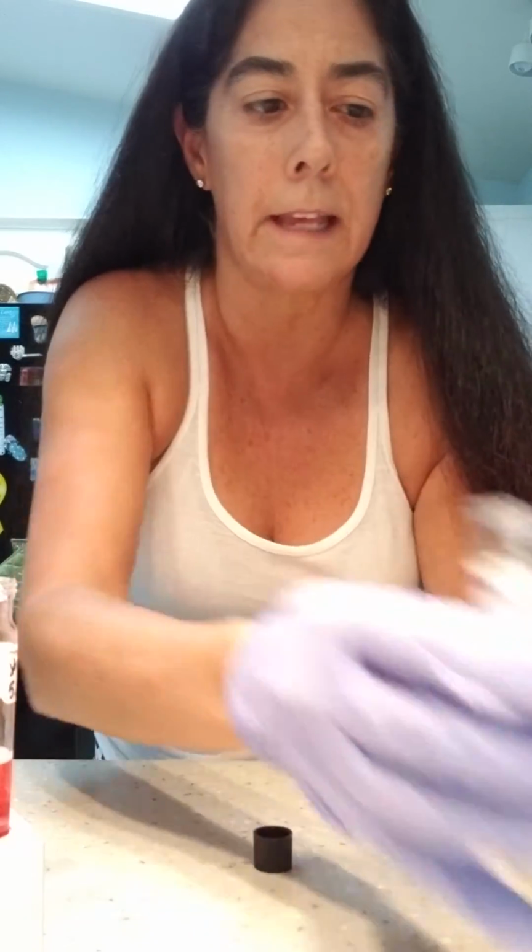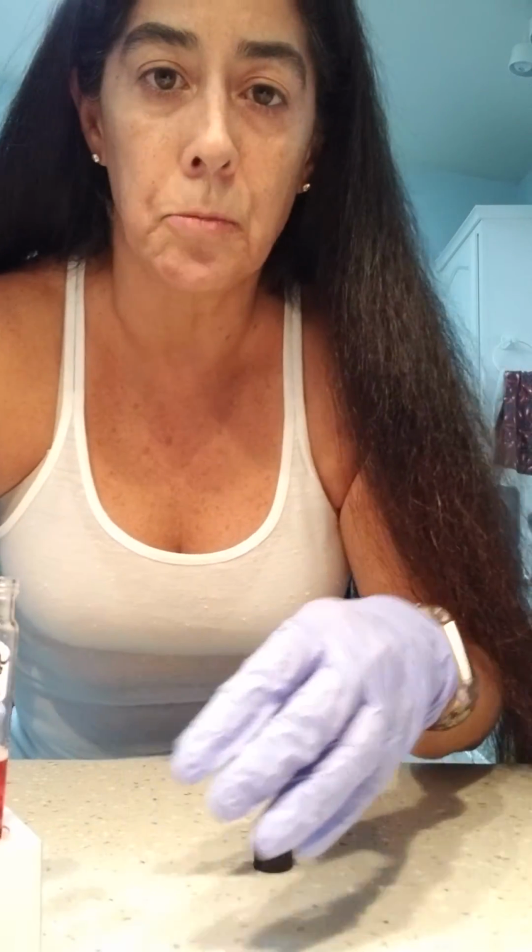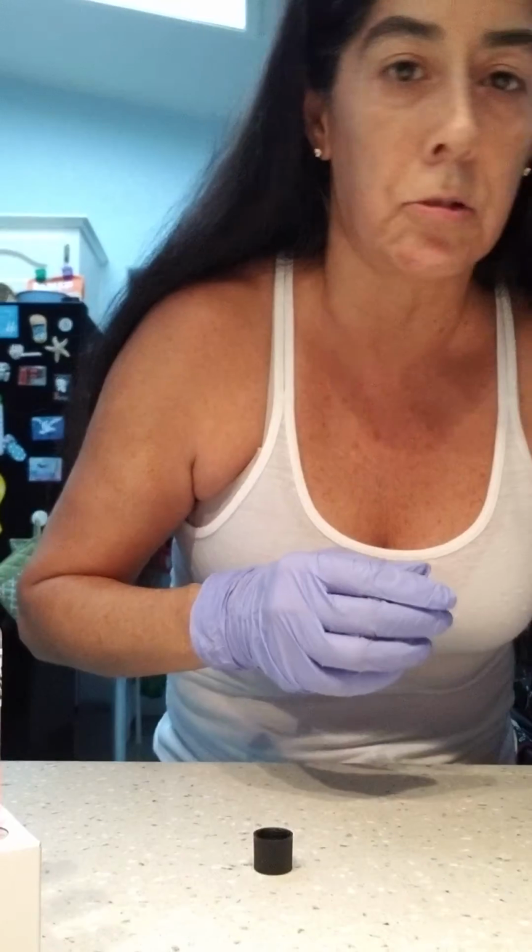So now I've sterilized these 2. I'm going to sterilize these 2, and these are the only 2 I'm going to do, and then I'm going to move on so that we can make this a quicker process if we can. I have already had my Durham tubes soaking in alcohol, and I pulled them out to dry.